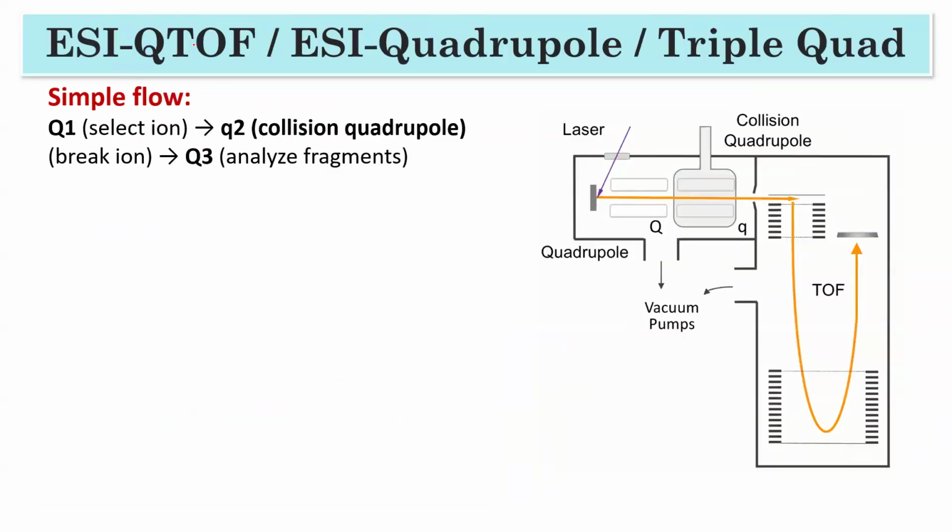Okay. Someone was asking me about QTOF and all. So ESI is electrospray ionization. This is just the ionization method. And TOF is the mass analyzer, right? And what is Q? This is very important. What is Q?